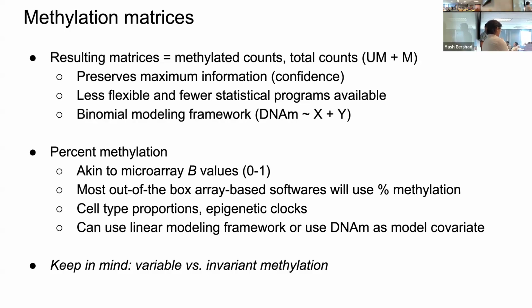Okay, that was like a torrent of information. Yeah. So, sorry if I missed something, but for the cell type proportions, we need to perform a decomposition. Is there already a reference panel for the sequence-based methylation, or is there any kind of reference-free method?